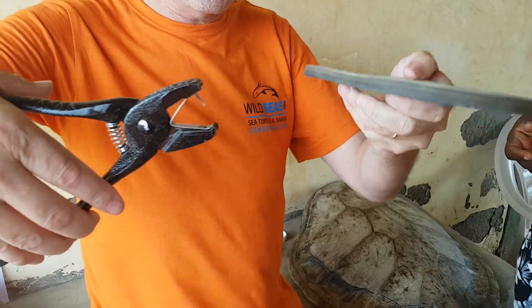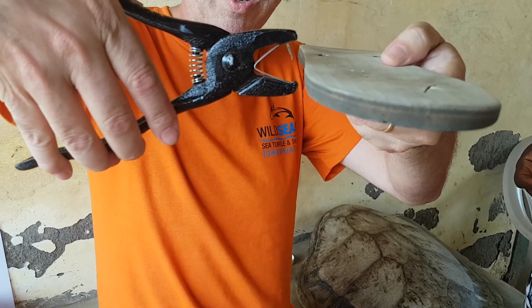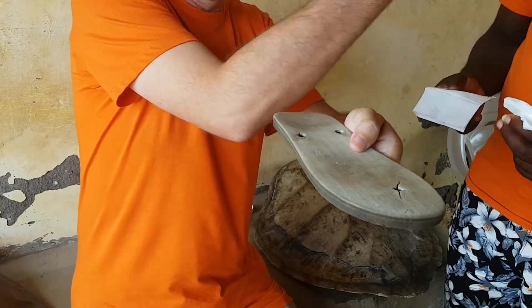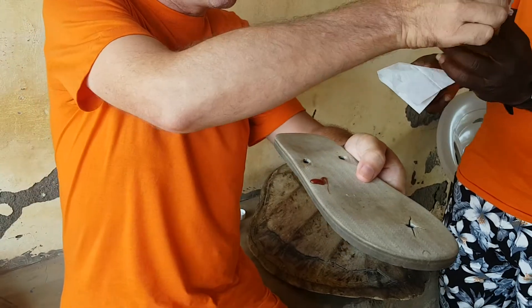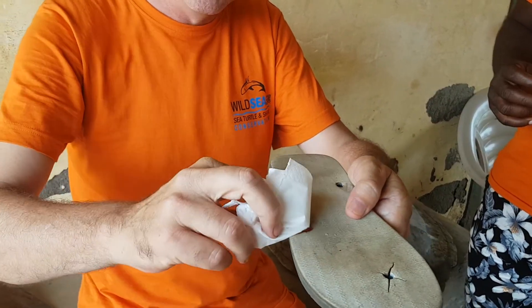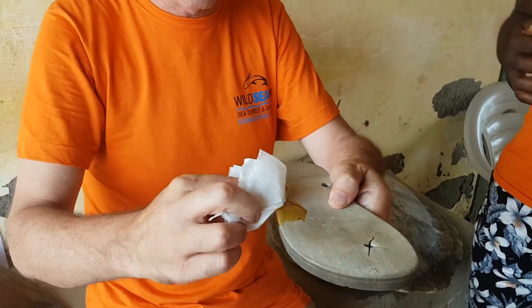So we now have the Sea Turtle flipper and the tag, but before we apply the tag we must apply some antiseptic to the tag area. In this instance we are going to use betadine, which will ensure there is a minimum risk of infection. We simply rub it and make sure all sides have been covered.